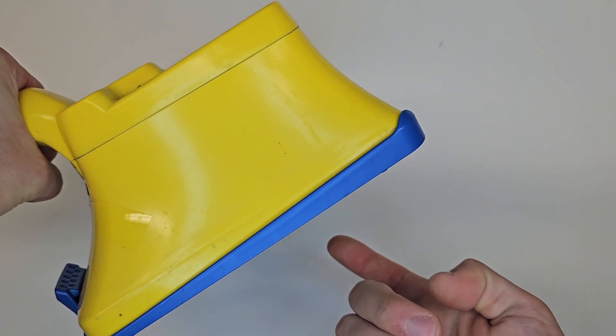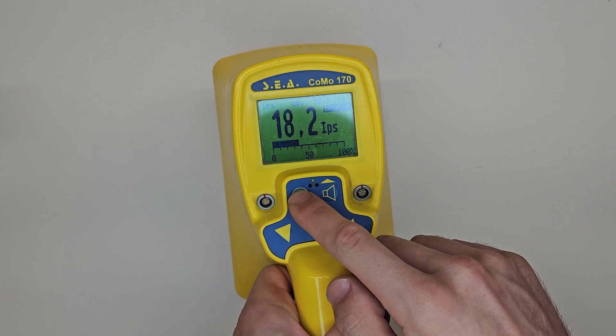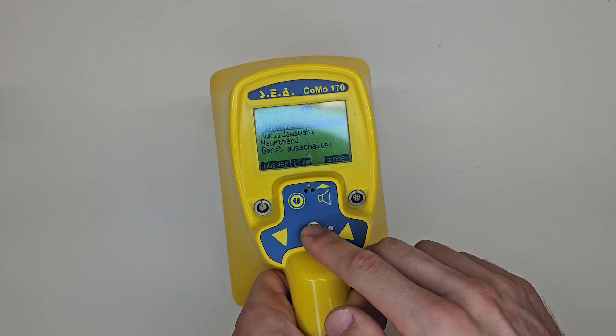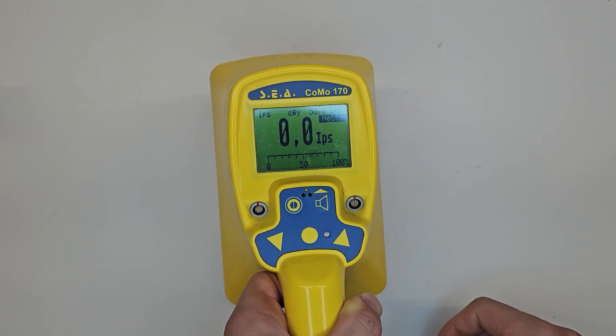It also measures contamination at the bottom using a plastic scintillator. So depending on the value shown on the monitor, I have to measure from the bottom or at the front. The IPS or CPS — counts per second, impulses per second — are measured at the bottom.